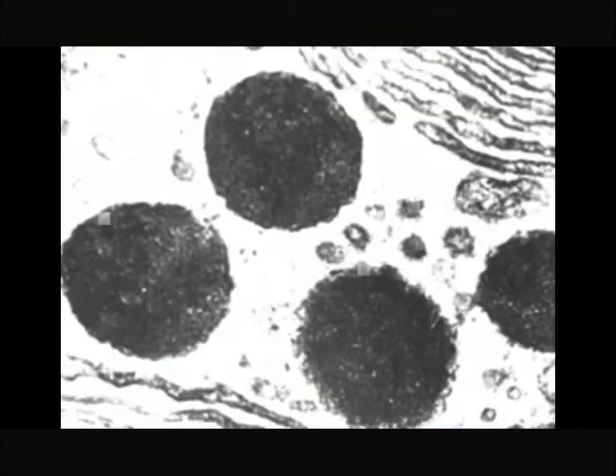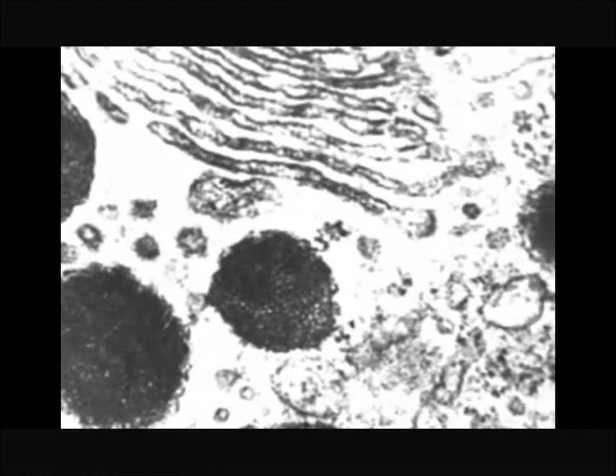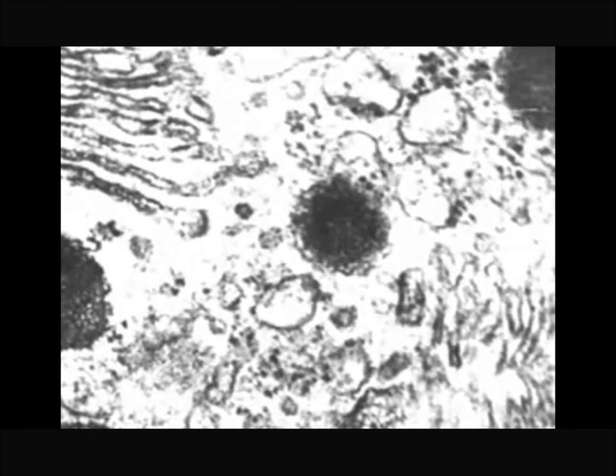The beam that reaches the film consists of the different amounts of electrons that pass through particular regions of the specimen. This difference is responsible for the contrast in the film. The original image produced by the electron microscope is always black and white, and it is not possible to see it directly with the eye.